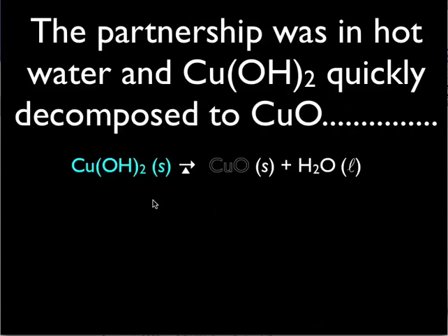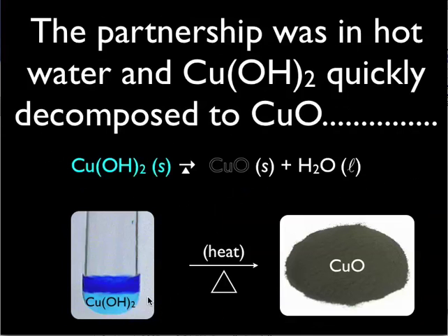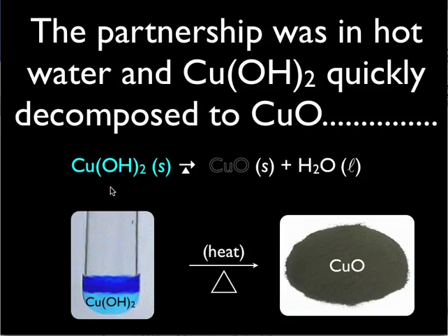Once we have our copper two hydroxide sample, we can change that simply by adding heat. It's not long before you go from having a blue-green precipitate to a blackish precipitate. This is due to the fact that we are decomposing copper hydroxide into two other substances: copper two oxide and water. This is a decomposition reaction because we're going from one compound and breaking that down into two other compounds.